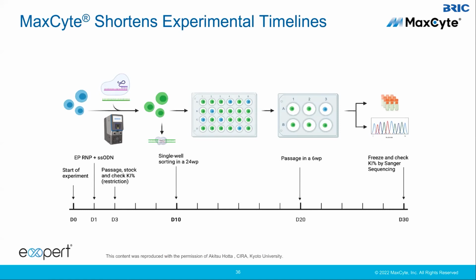And I know there are longer approaches which involve incorporating an inducible Cas9 into the genome by piggyBac and then excising it later. That can take more than 3 months and it's extremely laborious. So this is a pretty straightforward approach, which can be incorporated into your current lab's workflow.